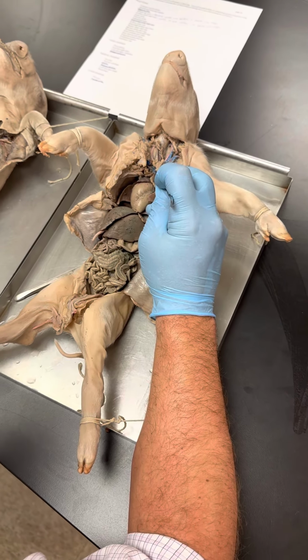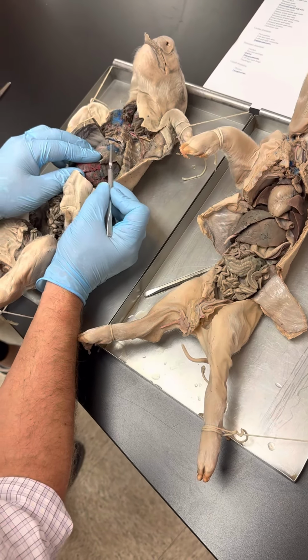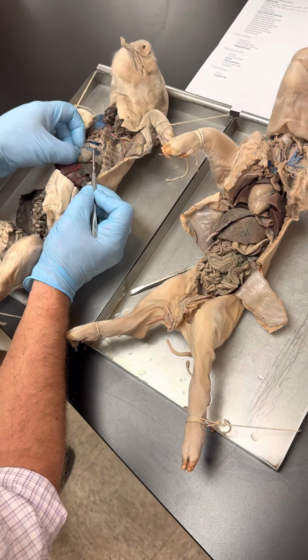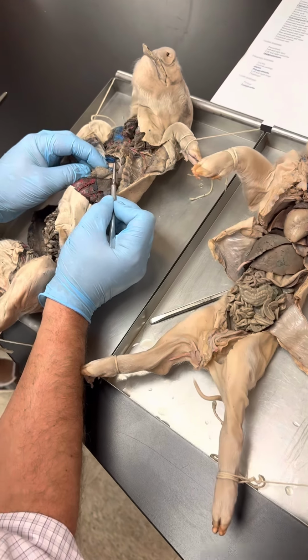Next will be aortic arch. So here's this structure. This is not your aortic arch. This is your pulmonary trunk. But we pull that trunk to the side. There's your aortic arch.